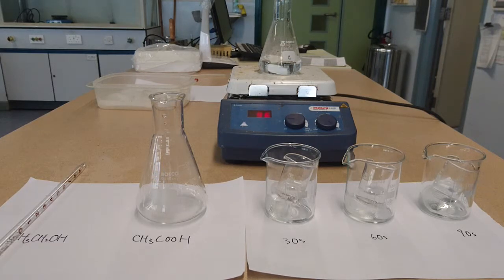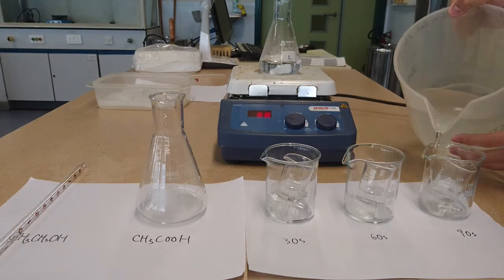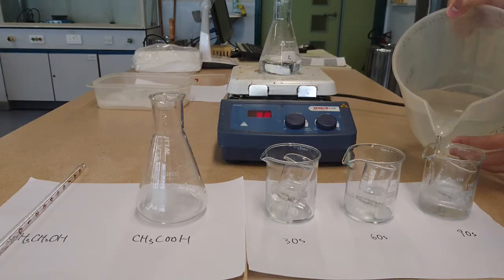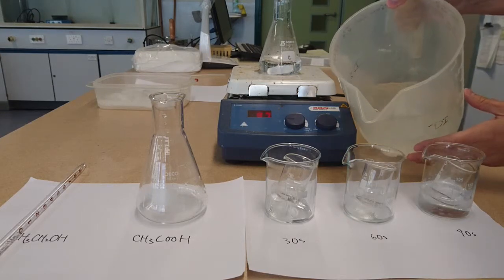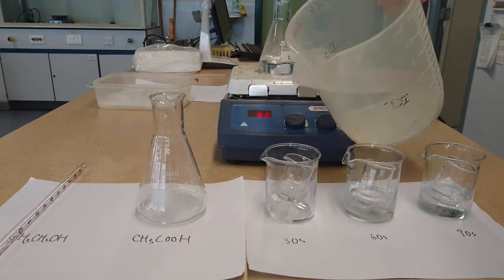And of course, remember, don't just use the ice, but better use some ice cold water. What is the ice cold water? Just add some water in the beaker, and that is it. So the cooling effect would be much better. But of course, prepare it before that. Don't prepare it at last.